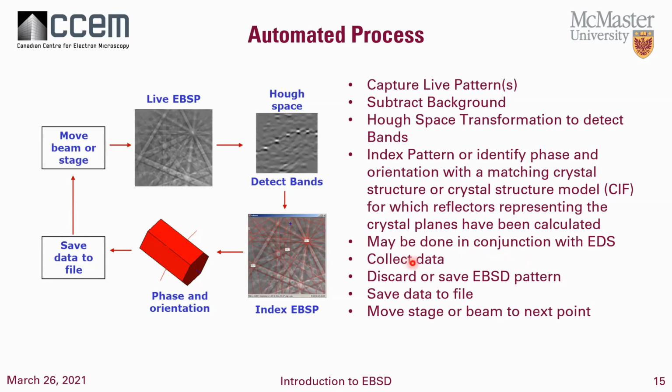We then collect the data. What most people find surprising is that quite often we just throw away the EBSD pattern as soon as we've collected it. You do have the option to save it. One of the problems with doing this is that it can make the data set quite large. The largest I've ever had is 500 gigabytes. It took about a day to take off the computer. So it's something you have to keep in mind, whether you want to spend half an hour waiting for the file to open in order to analyze the data.